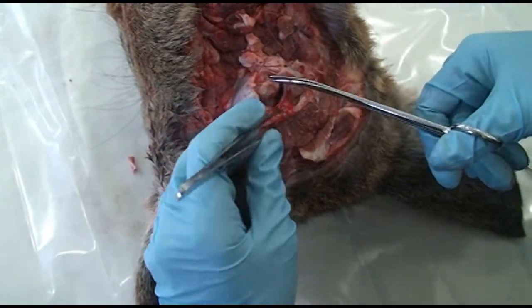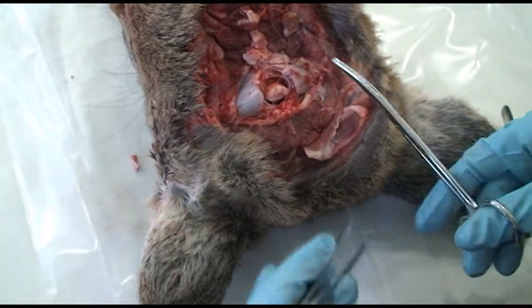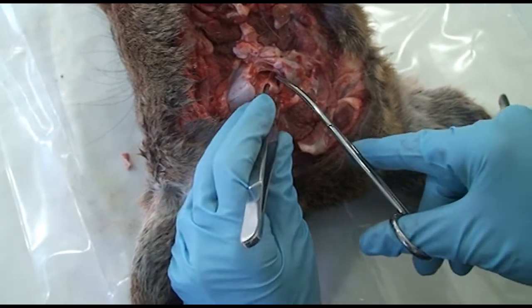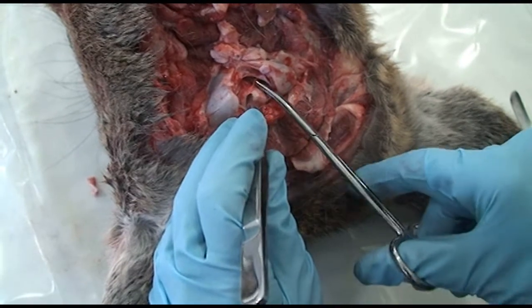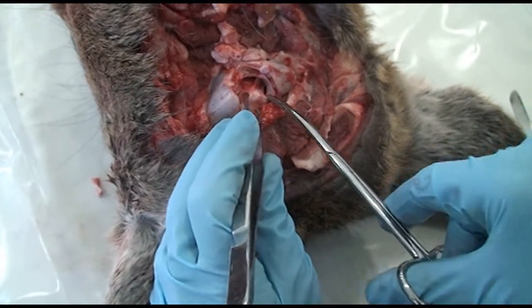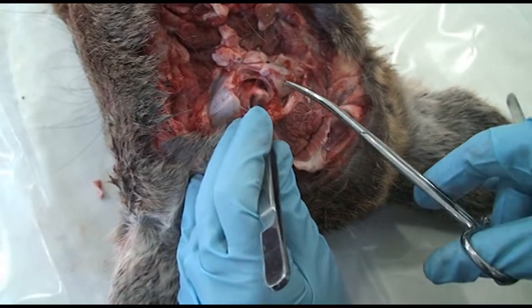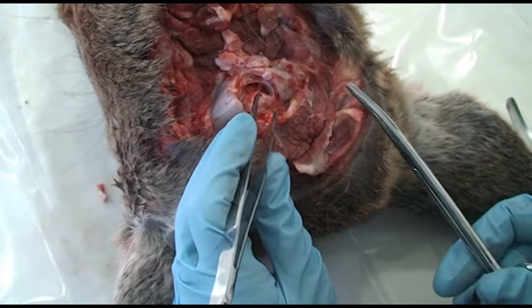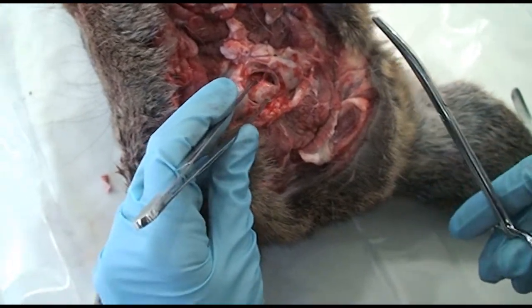And that goes around the entire brainstem. That down there's pretty good. The other thing is you can see these little bitty connective tissue threads that come in right there and attach to the brainstem. Those are the cranial nerves coming in, and they come in on both sides of the brainstem. We have to sever those connections or they hold that brainstem in there and make it difficult to remove.